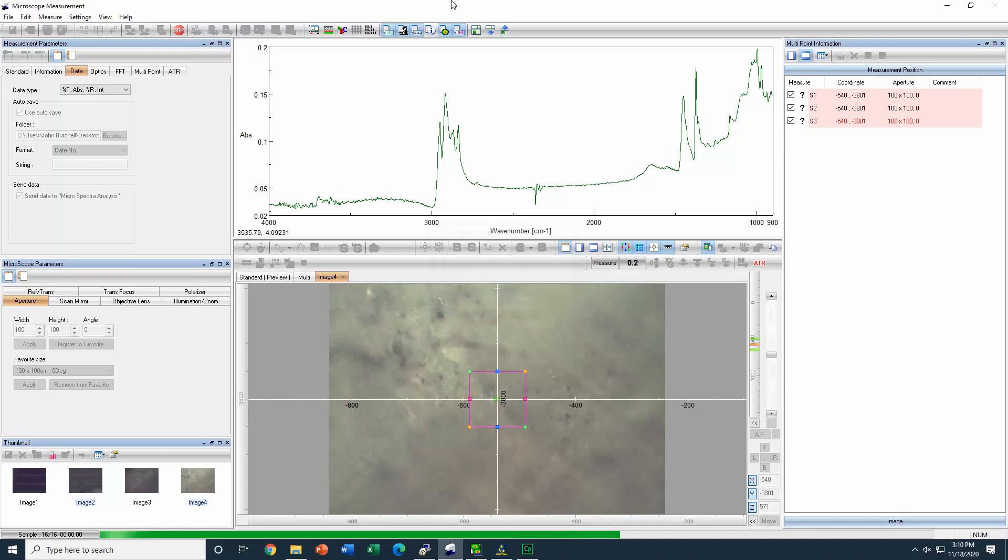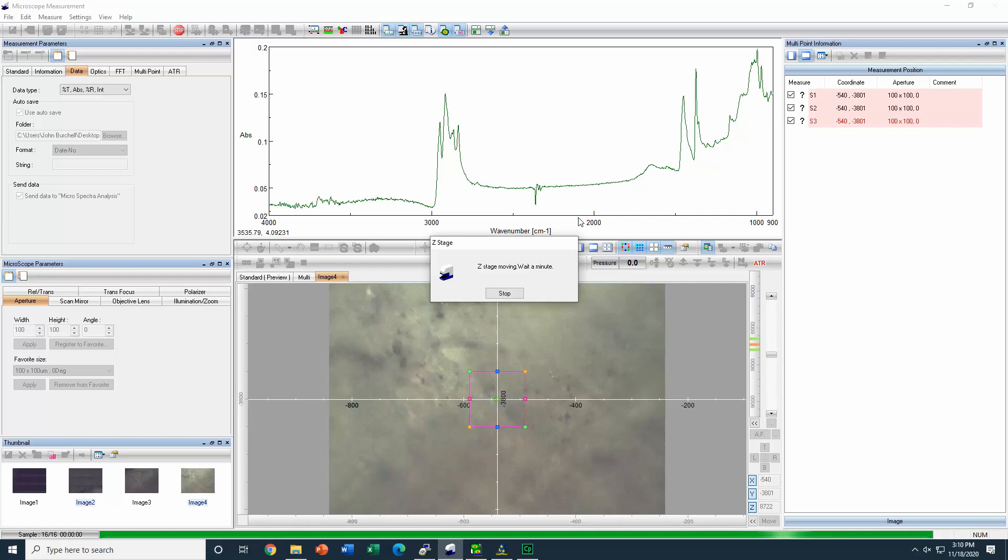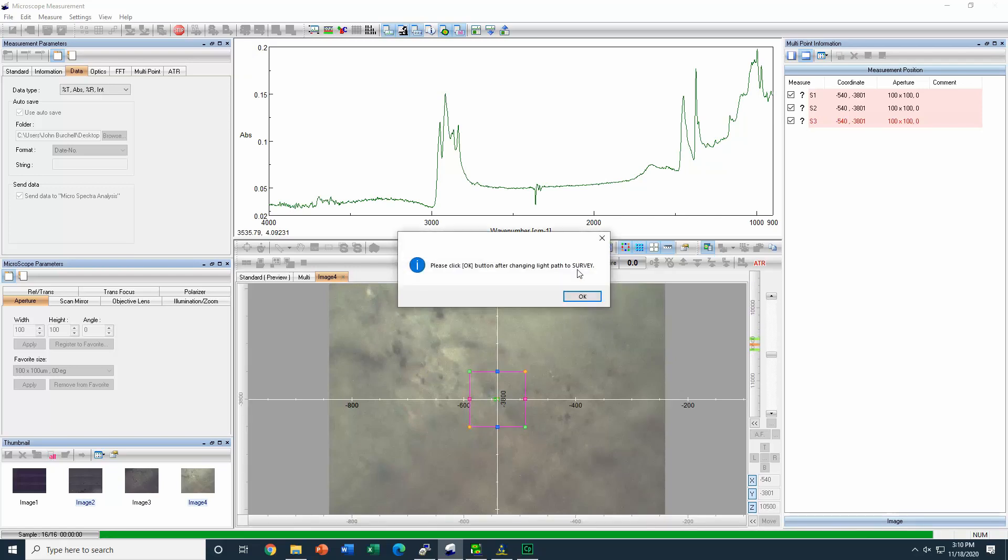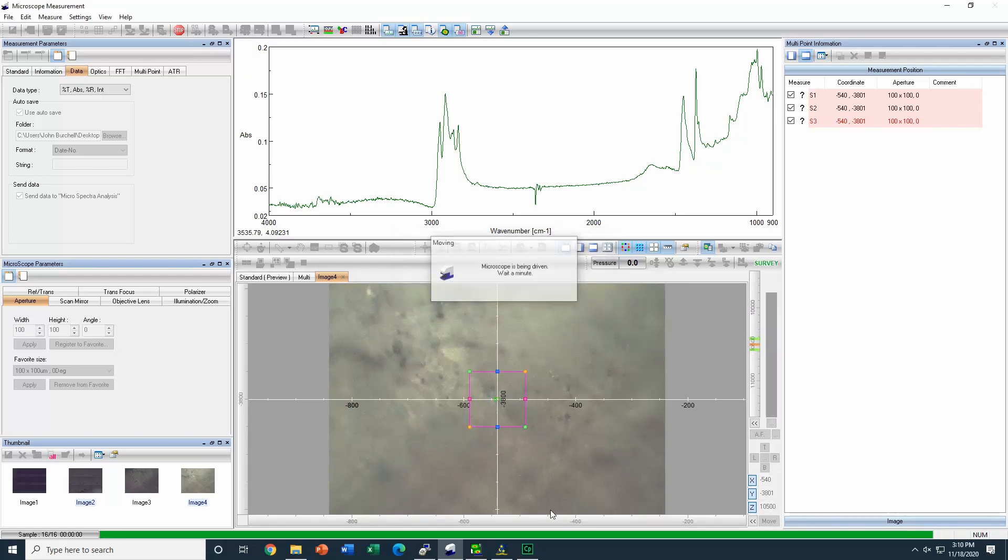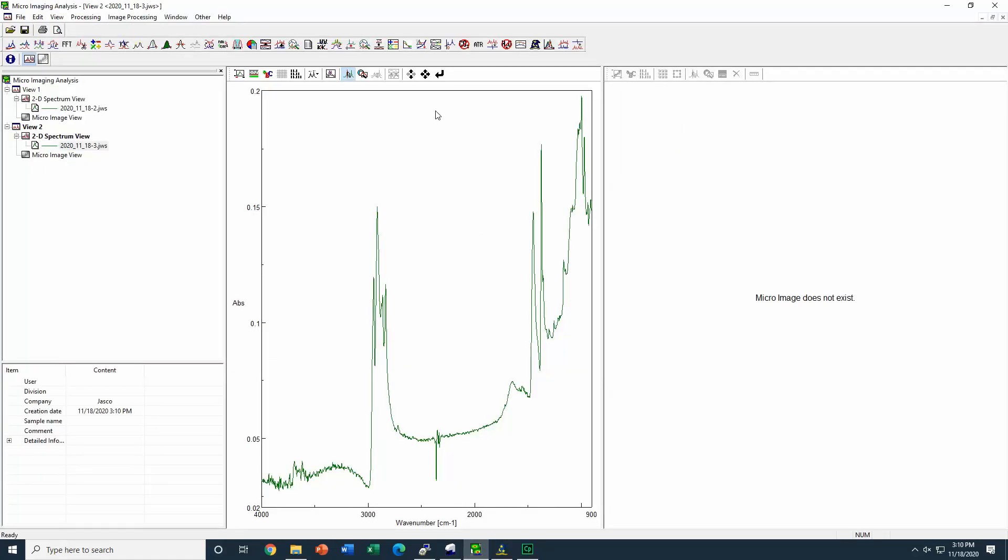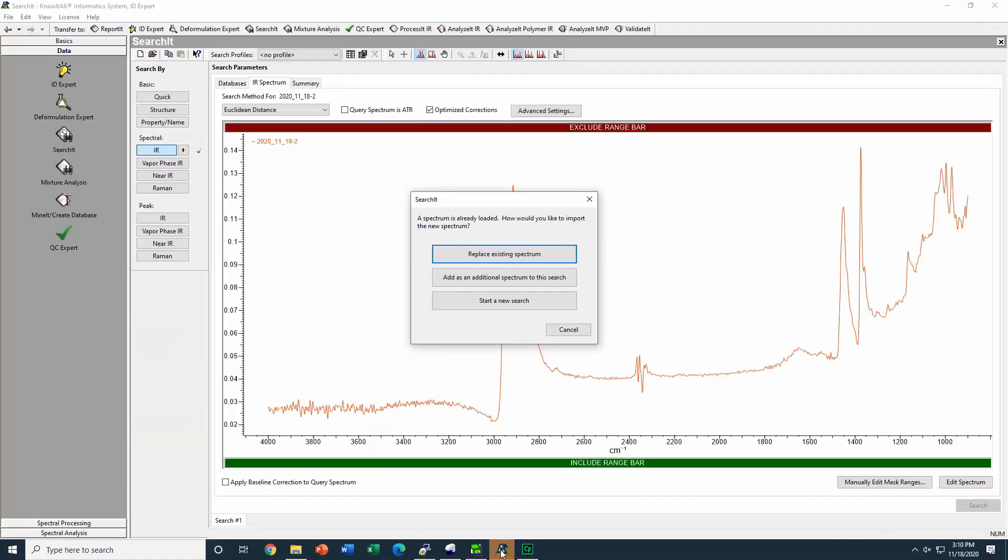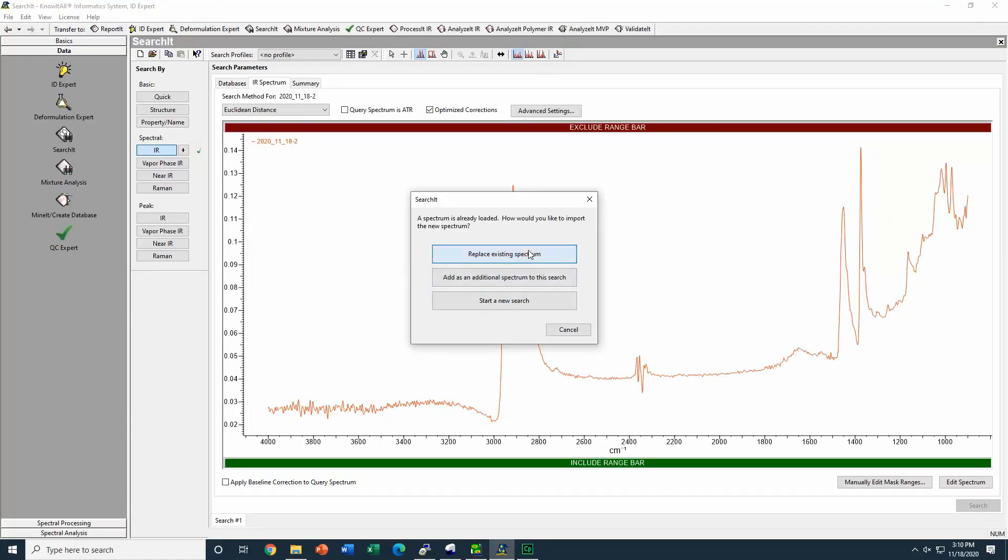In this measurement, we are using an aperture of 100 µm by 100 µm. As with any other FTIR measurement, we collect the background first, and then when the sample is in contact with the ATR crystal, we do the measurement.